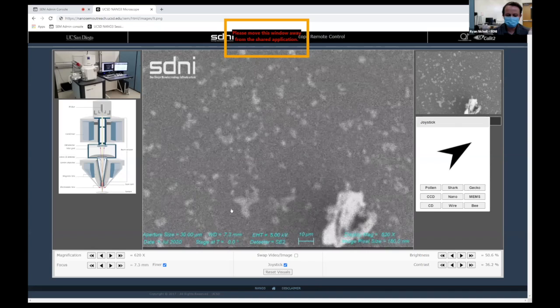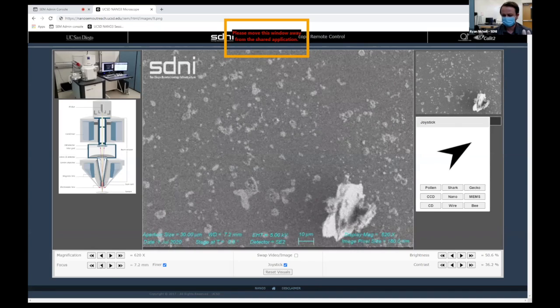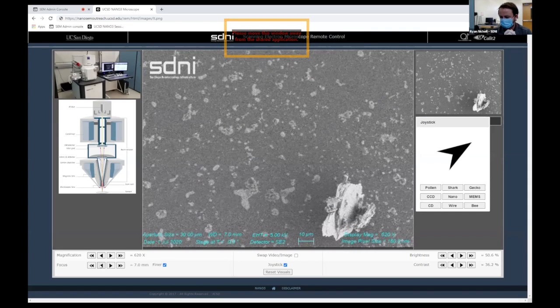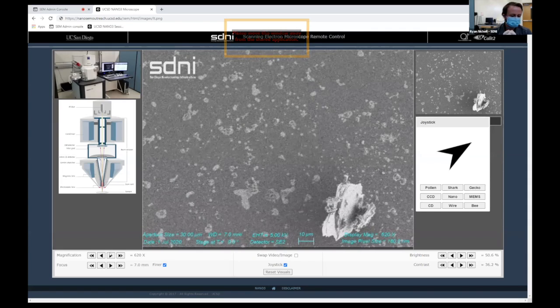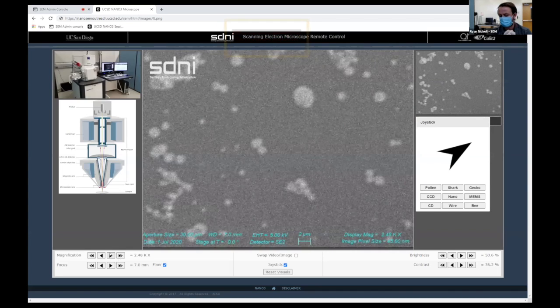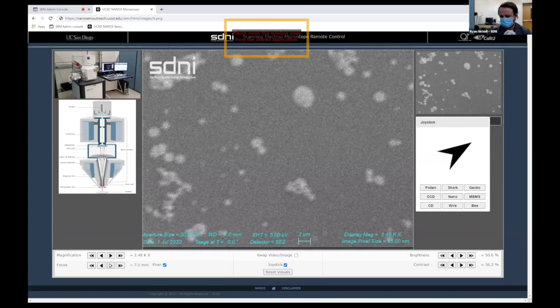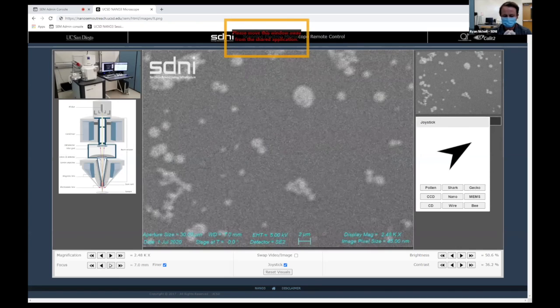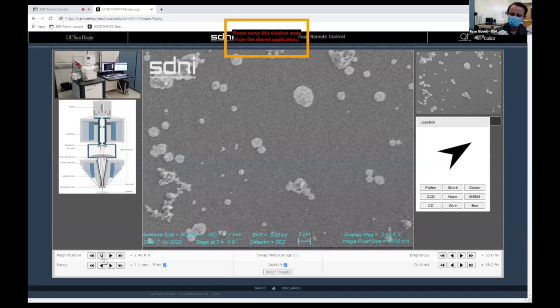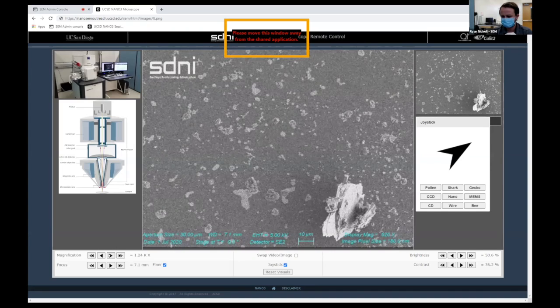And so one of the points that I always tell classrooms is that what we're about to be looking at and focusing on is completely invisible, not only to the naked eye, but to most other microscopes. General optical microscopes that you might have in your classrooms cannot resolve this. It's fundamentally impossible to use those systems to see these types of things. So whenever you hear about nanotechnology and nanoparticles and nanomedicine, these types of things need an electron microscope.